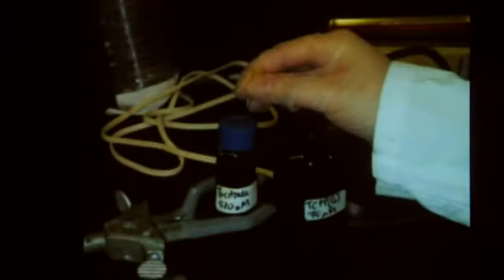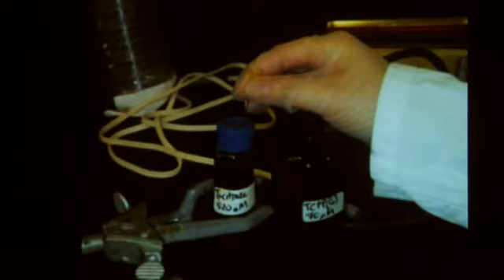The titanium-3 citrate will be injected into 2 of the 3 bottles, and this part must be done carefully. So we go into further detail for that. That's the titanium citrate, the blue stuff. We want to keep it under nitrogen. We want it in its reduced form, and if oxygen gets in there, oxygen's an oxidizing agent, and we don't want it to oxidize the titanium.